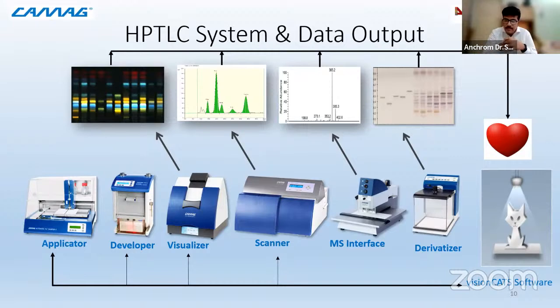Now, the visualizer is the place where the documentation happens. The image which you are seeing is under 366 nanometers, where the background of the plate is dark and the bands are fluorescent. Now you will say there is another wavelength, which is 254. I'll show it to you as we move into the instrumentation, where the plate background is bright and the spots appear to be dark. That is known as the quenching.